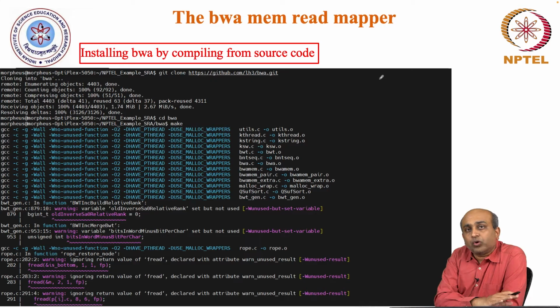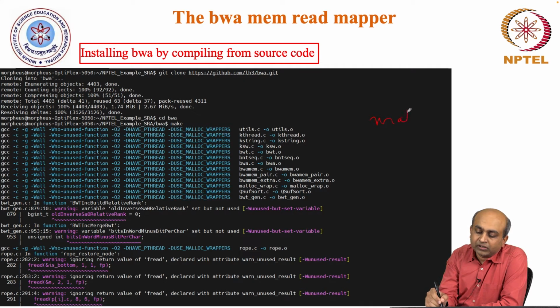Right, so once you have downloaded your reads, the next thing is you probably want to map them to a reference genome and then see how this particular breed of chicken is different from the standard reference that is there for chicken, right. To do that, the first thing is you have to map the reads to a reference. When we say map the reads, we are taking these individual sequencing reads, aligning them to a reference genome that is already available for chicken, and based on that we are generating your BAM files or alignment files, right.